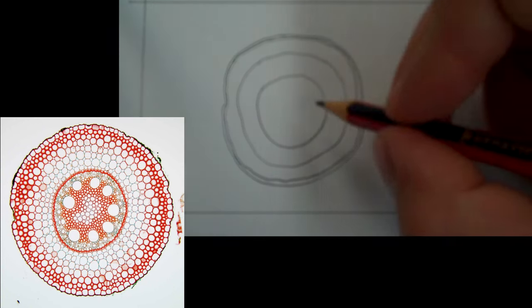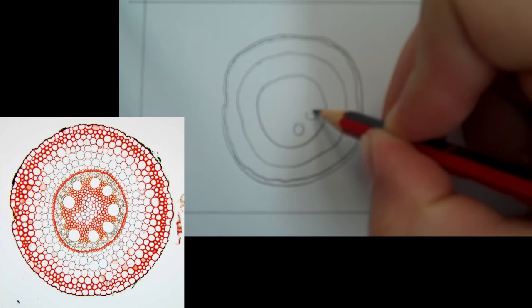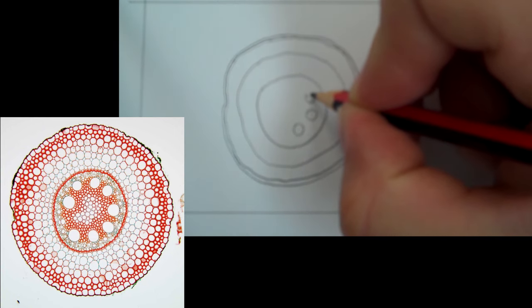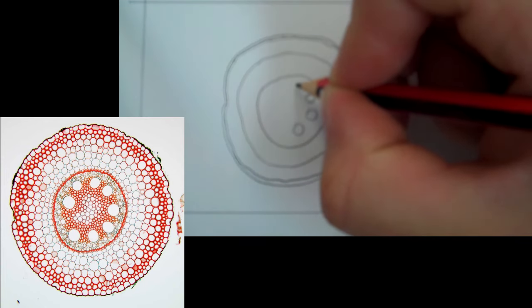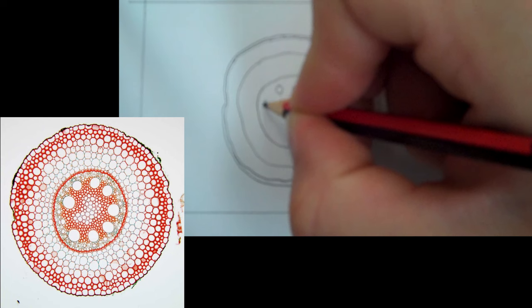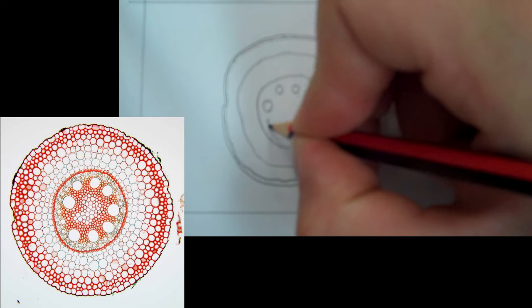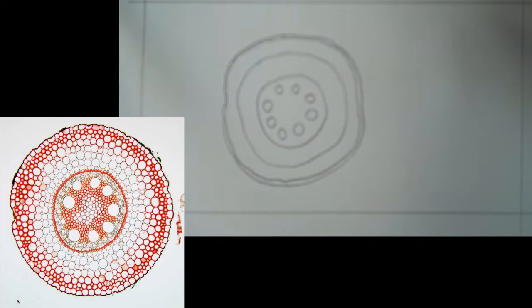So let's go for the circular structures, these large white circles. 1, 2, 3, 4, 5, 6, 7, 8. By the way, those are actually xylem.